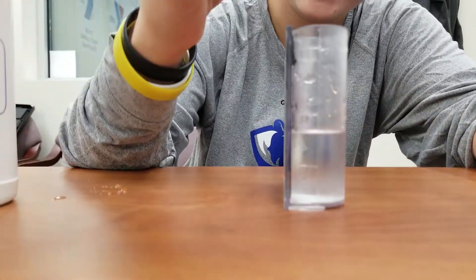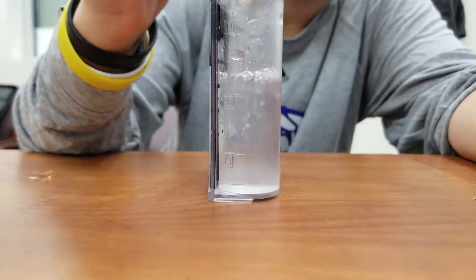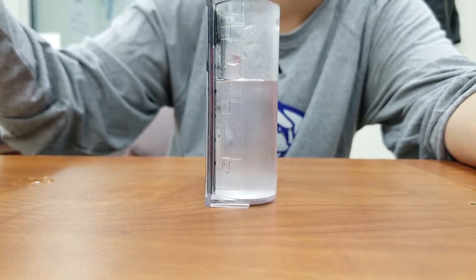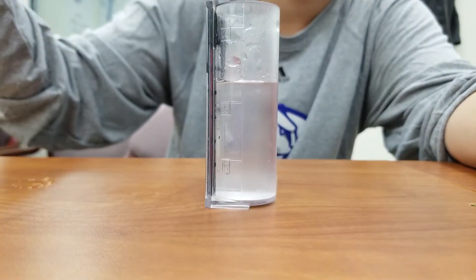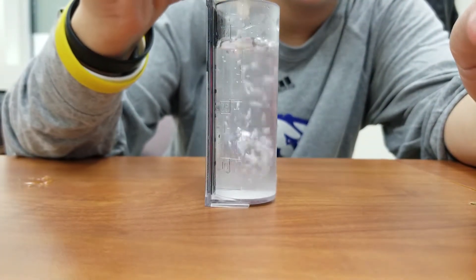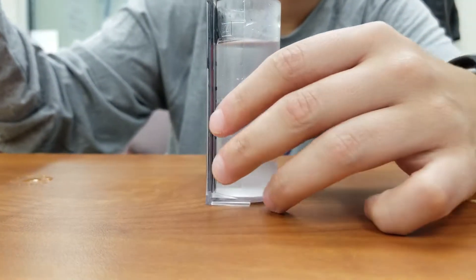This is our pH test. We're going to fill the tube up to the 44 mark and use the bottom line of the bubble to make sure it's lined up.